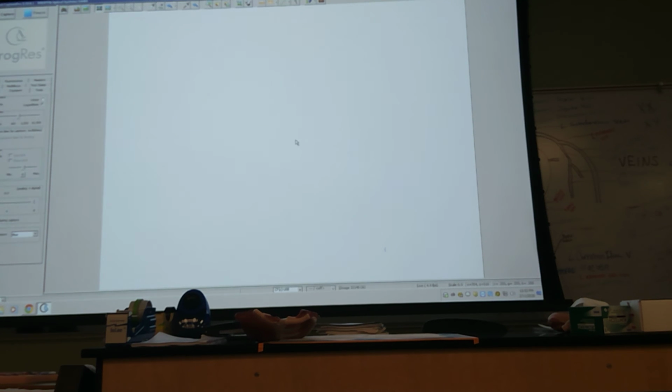Especially blank features. Here we go. Oh, there he goes. Come on. Come on. Don't be shy.